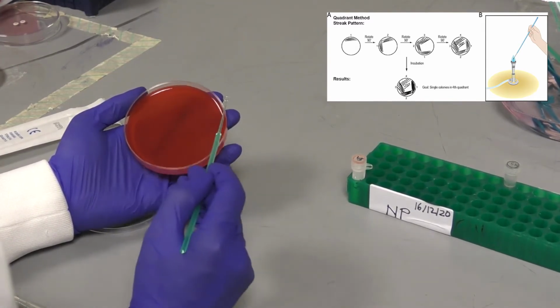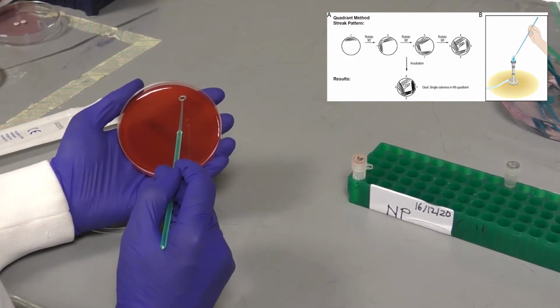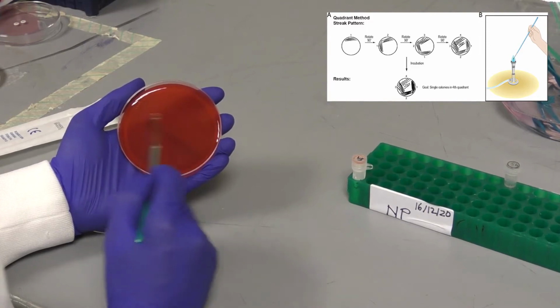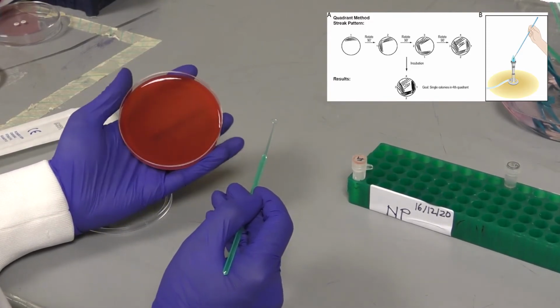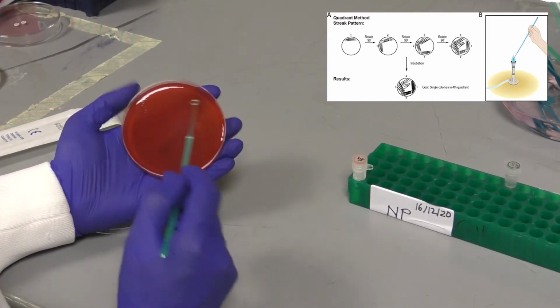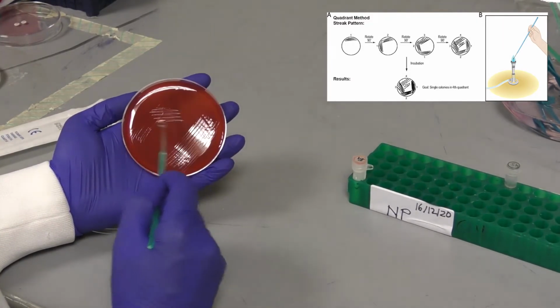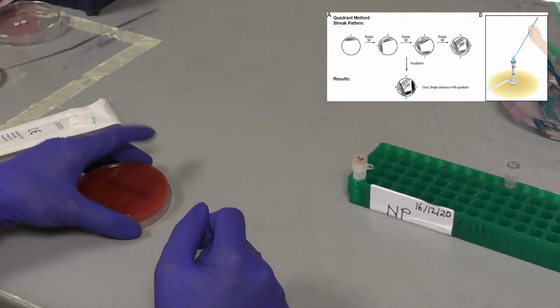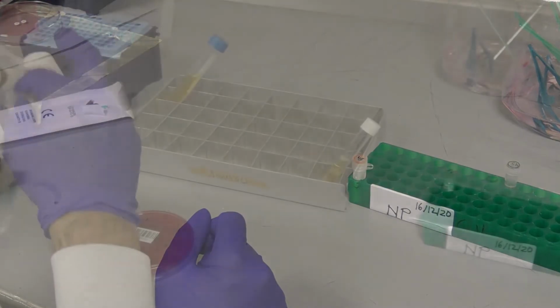Streak 1, streak 2, streak 3, streak 4, your final streak to ensure single isolate dilution. Then discard the disposable loop into your 10% bleach discard container.